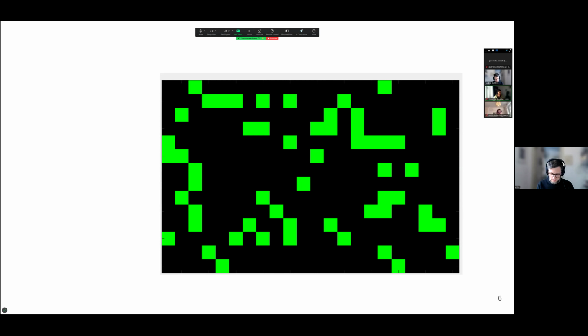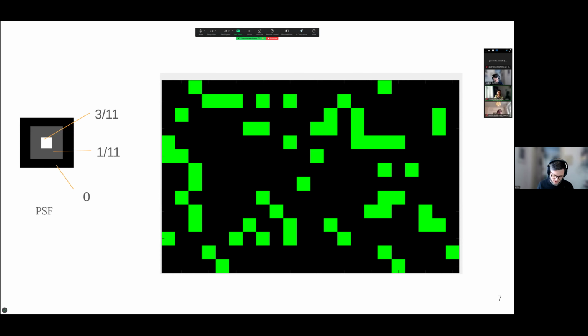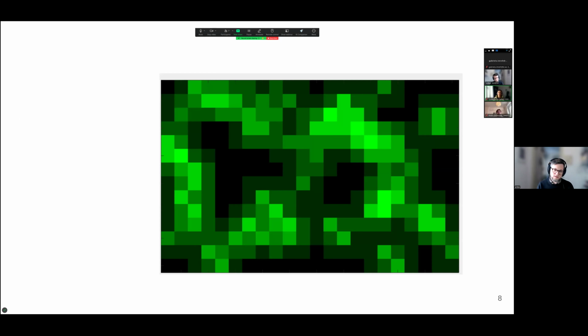And already that's disappointing, but as you very well know from the course, there's also this actor, the point spread function, that will blur the data, which is something we can't avoid, because it's a consequence of the physics of light. So a more realistic rendering of what you would see in the scope is this, if we now disregard noise and all the other complications.